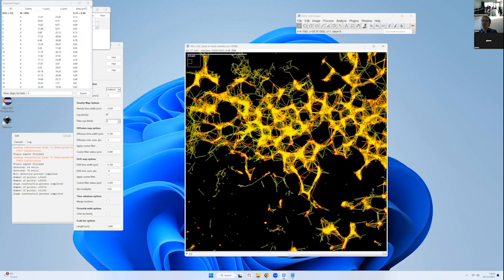No, that's one. So you see, this is not great, because you didn't change the parameter like here, it said 0.1. Change it to 0.1, and you apply it again, and it's not changing.